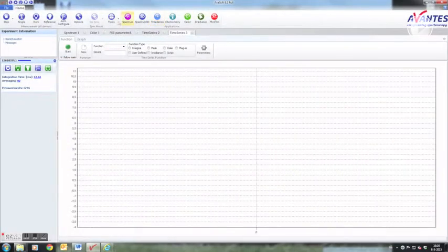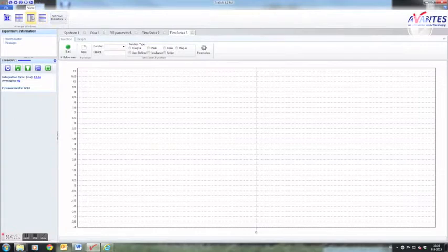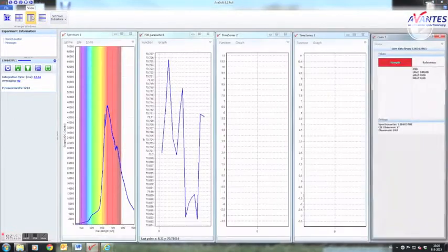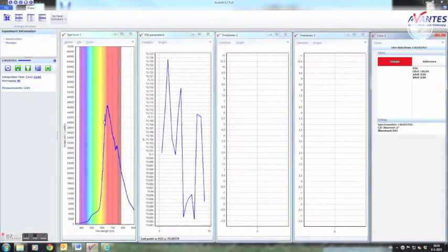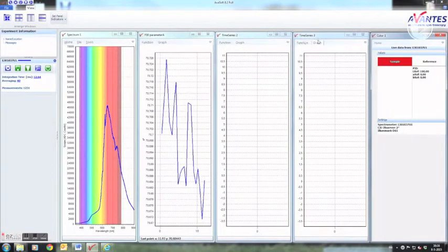You can open multiple time series tabs with different functions in Avasoft. When doing this you can follow multiple things in time.